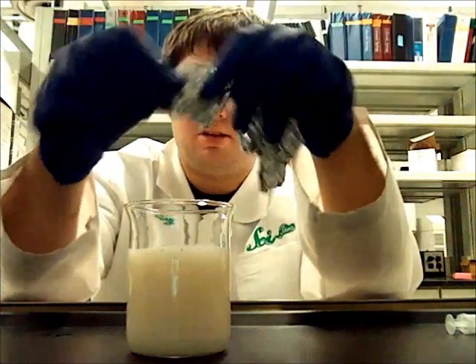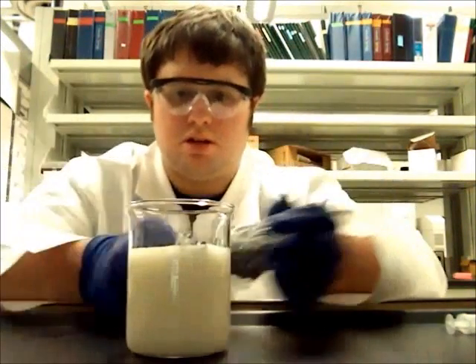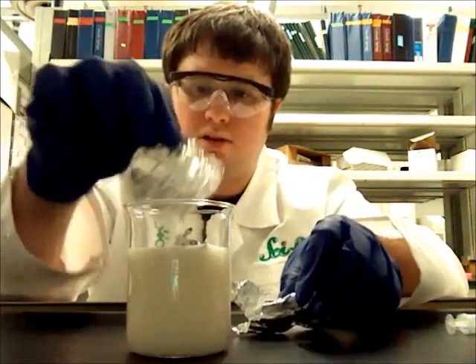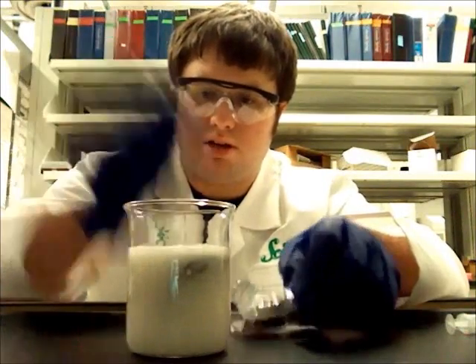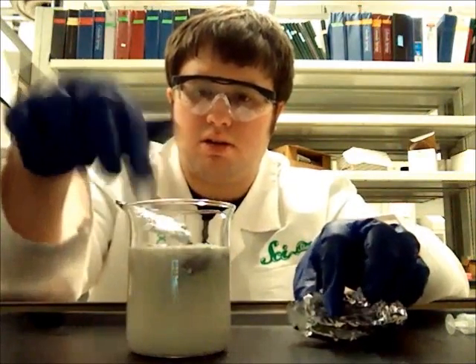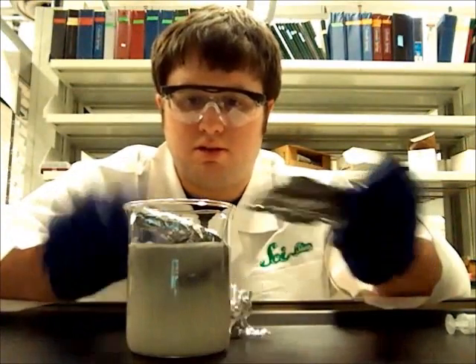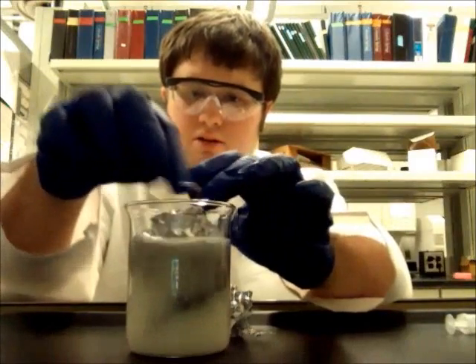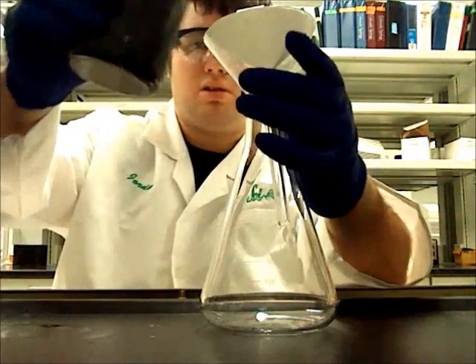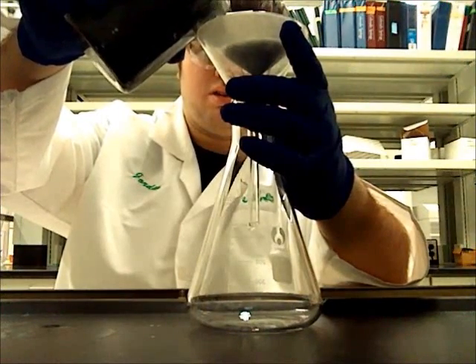I transferred the filtrate to another beaker. I added aluminum to the mixture to form aqueous aluminum chloride and precipitate the bismuth metal. There was some foaming as the aluminum reacted with the acidic mixture. The black precipitate you see forming is the bismuth metal.